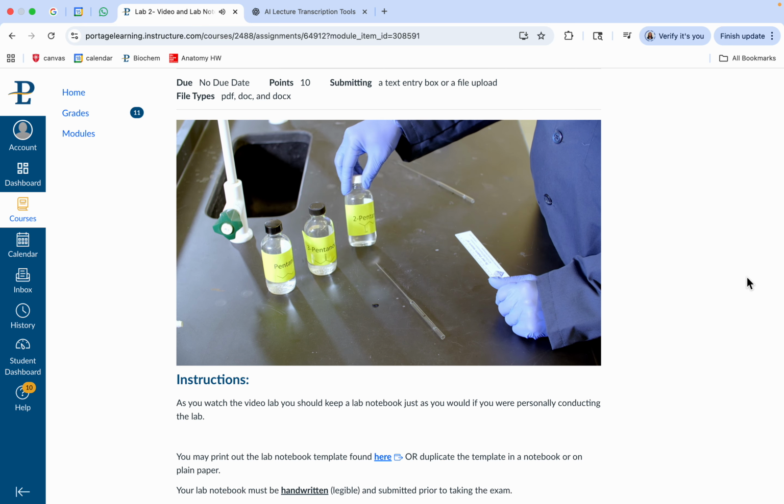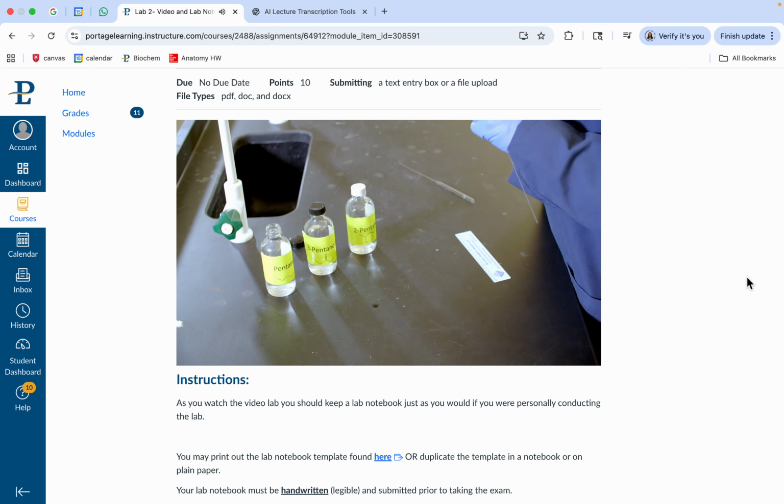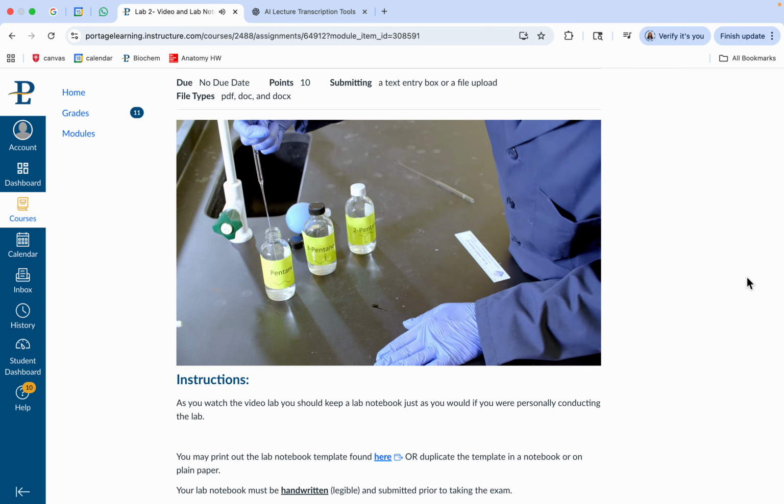And then alcohol has the OH group, and so of course they have hydrogen bonds. So what I'm going to do is we're going to look at each one of these, and I'm going to withdraw solution up into this tube, and then we're going to measure the time that it takes for each solution to go from the top mark to the bottom mark. I'm going to use my thumb just to make sure we get it right to the top mark, and we're going to let it drain out.